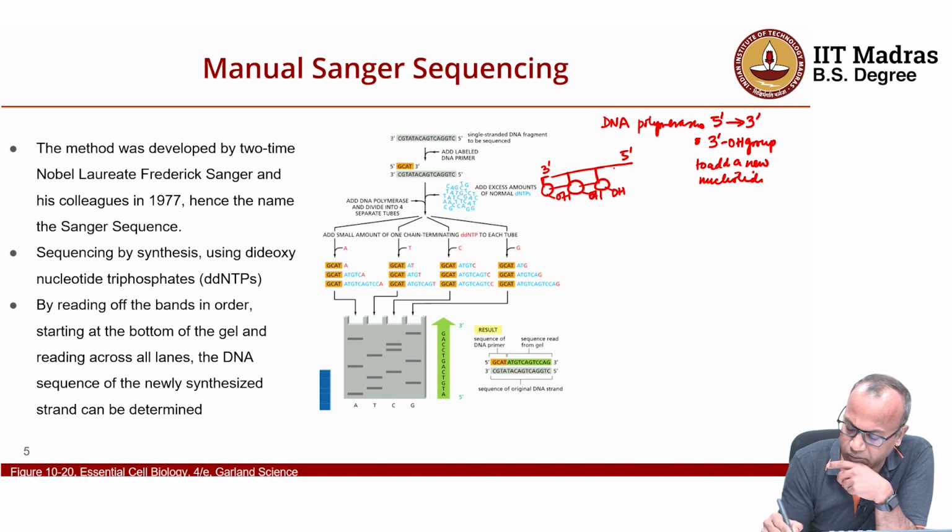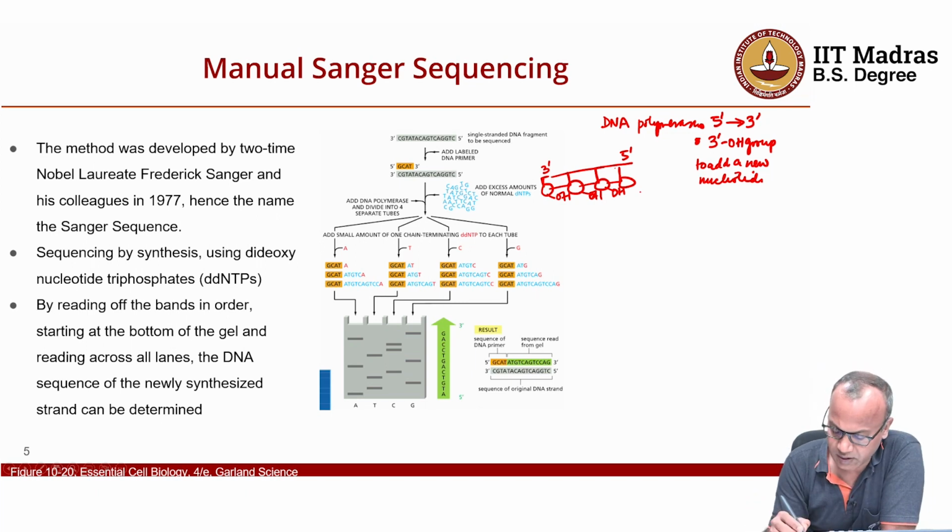It will keep on doing this as long as a 3' hydroxyl group is present. This is because of the fact that we are using deoxyribose sugar as a backbone for DNA.